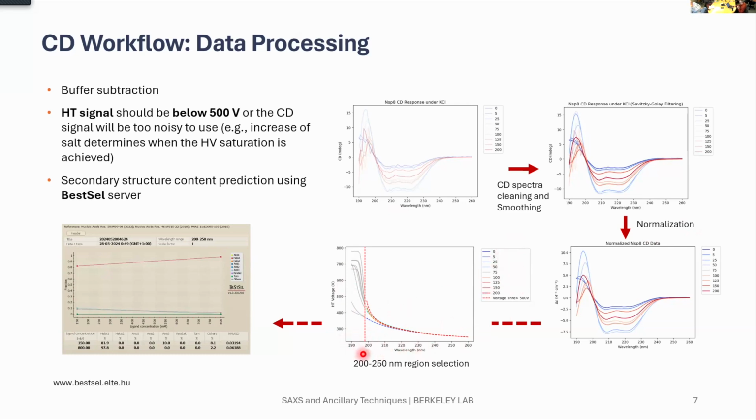Especially in the far UV region, we see an increase in voltage. During the obtaining of data for CD, the instrument maintains a constant workflow, right? And to maintain this constancy, it optimizes the HT voltage. Since it hits particles that start to absorb more light, the voltage goes up. Based on those differences in voltage, we can judge which region of our spectra is not good for analysis.